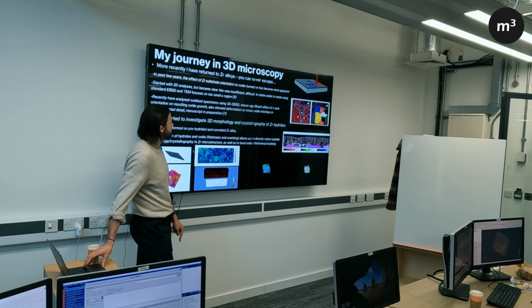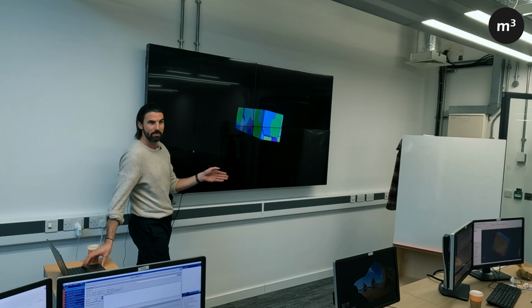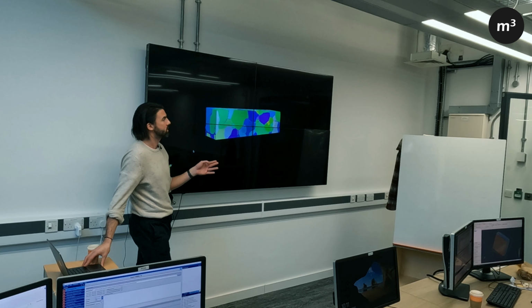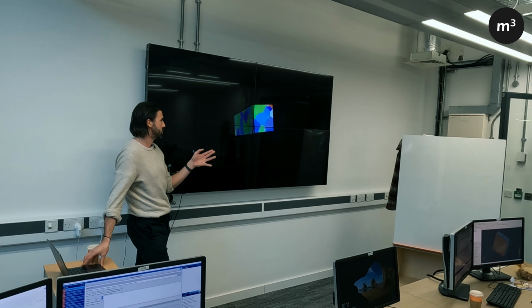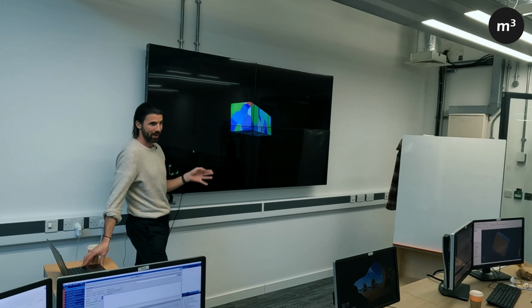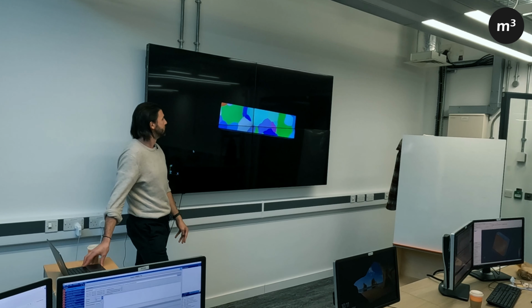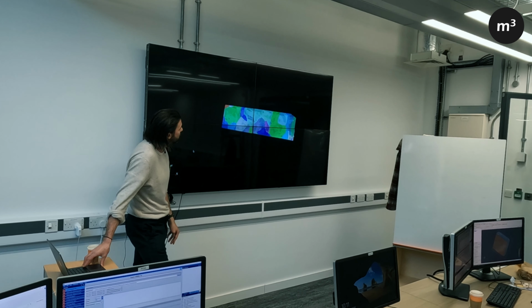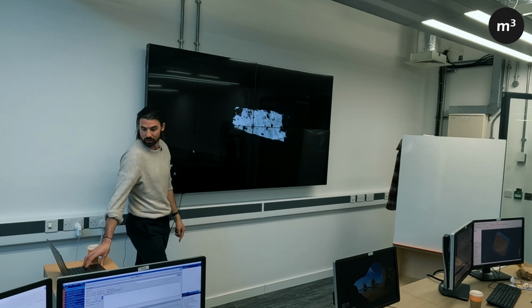And then even more recently, we've been looking at hydrides in zirconium. So I think I've got some bigger images now. So this is the 3D EBSD microstructure. At each slice we collect an EBSD map. Then at each slice we also collect a secondary electron image, which will image the hydrides. So the hydrides, I should say, form as a result of the corrosion reaction. It absorbs hydrogen from corrosion, and when you get enough hydrogen in there, you will eventually form zirconium hydrides at grain boundaries, and these are really bad for mechanical properties, and you can actually get cracking of the whole component down these brittle hydrides. So what we were able to do was reconstruct the hydride network in 3D as well.